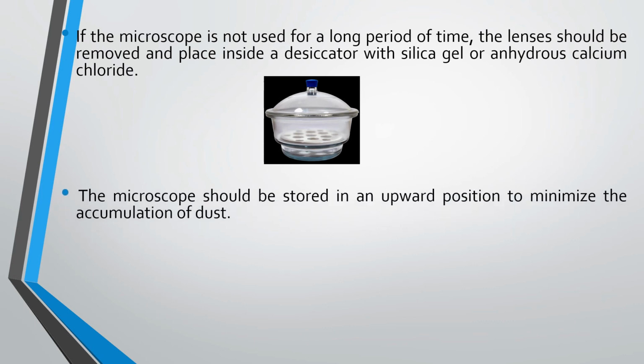And also you should store the microscope in upward position to minimize the accumulation of dust.